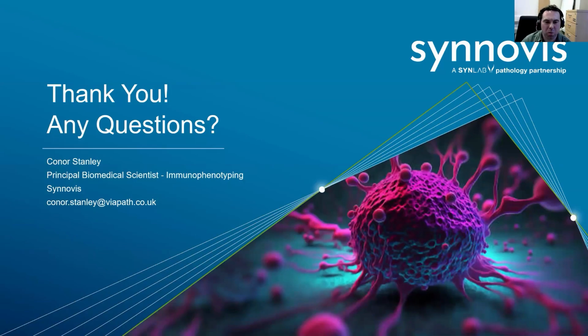And you can get quite a lot of information from quite a quick test. So that's one of the real benefits of flow, is how fast the test is and how much information you can get in such a relatively short amount of time. And it's generally the first test that clinicians will look to, especially in cases of hematological malignancies. You could be waiting weeks sometimes for molecular results, whereas if you're quick about it, you could have a flow result in under 4 or 5 hours.